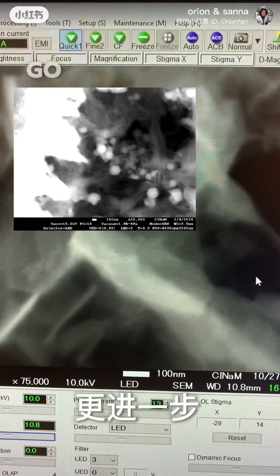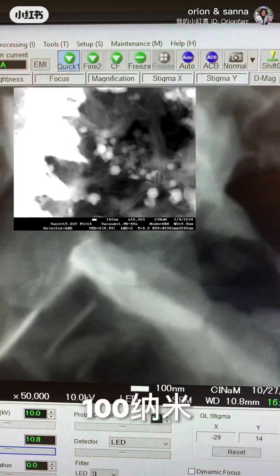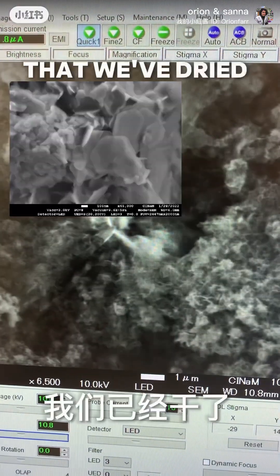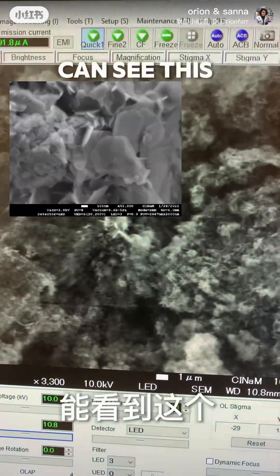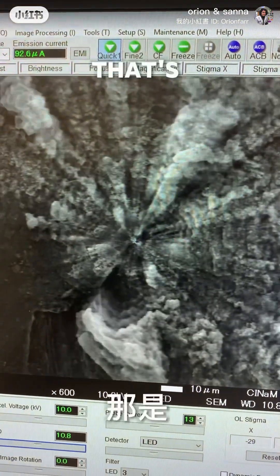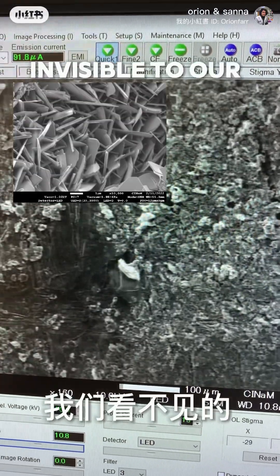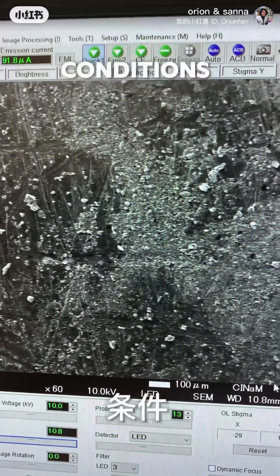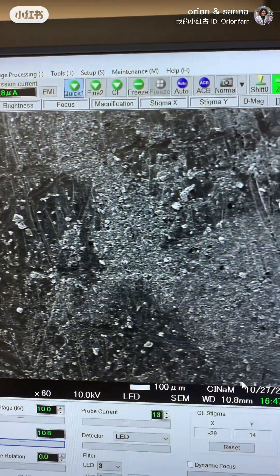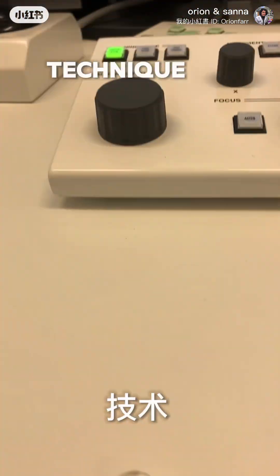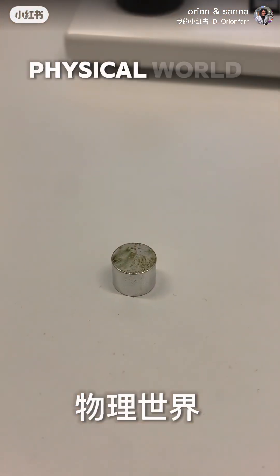And we can go even further. Here is 100 nanometers in this mineral suspension that we've dried out. You can see this really tortured landscape that's completely invisible to our naked eyes under normal conditions. Electron microscopy is a really awesome technique to examine the physical world.